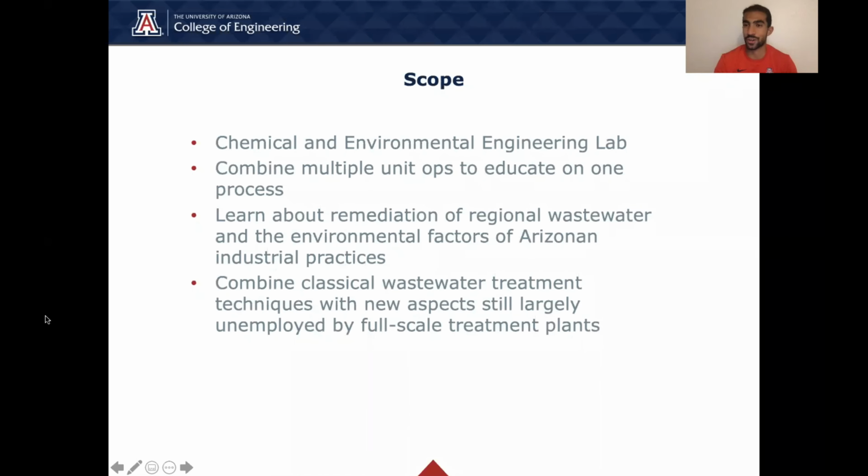The overall scope or the overall goal of our project will be to design a wastewater treatment lab that's going to be located at the University of Arizona, the Chemical and Environmental Engineering Department specifically. The goal of the lab will be to use specific techniques, the classic techniques for wastewater treatment, by purifying raw water that is mixed and modeled following the regional industry here in Southern Arizona. And the students will be able to mix up these techniques, use them in different orders.